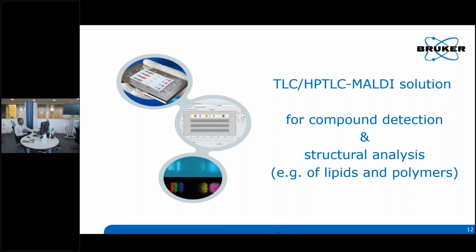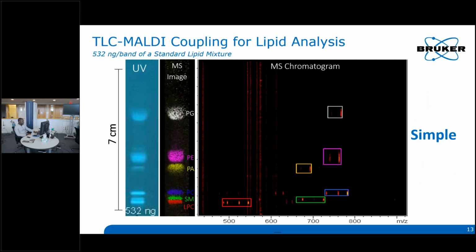And another thing is that they basically use a lot of resources, such as your columns, solvents. Over time, this all adds up to a bigger cost.